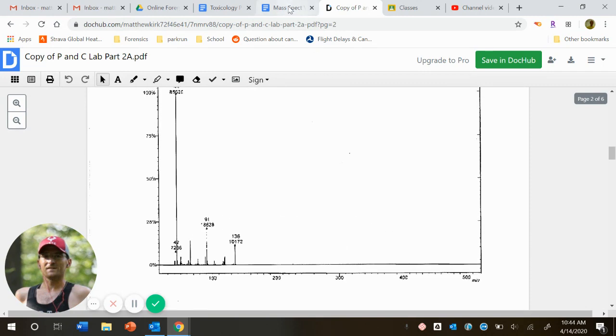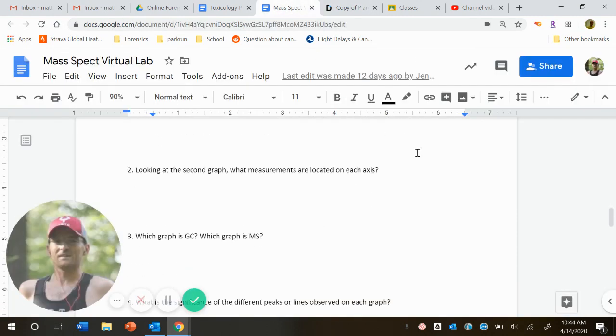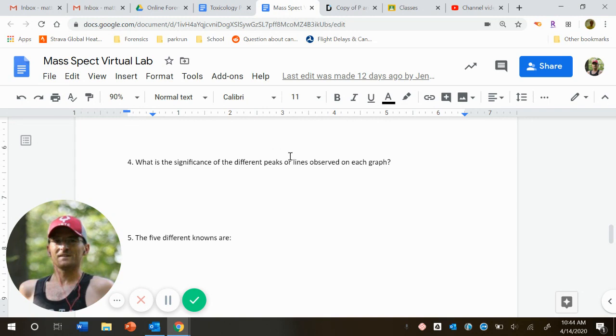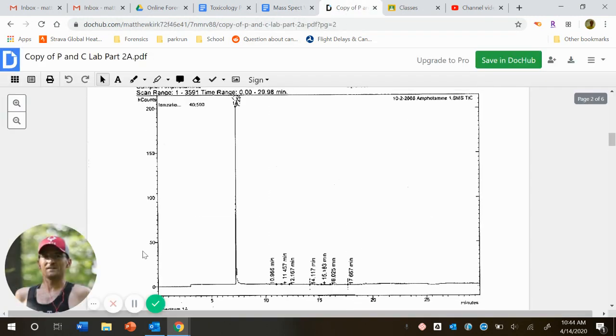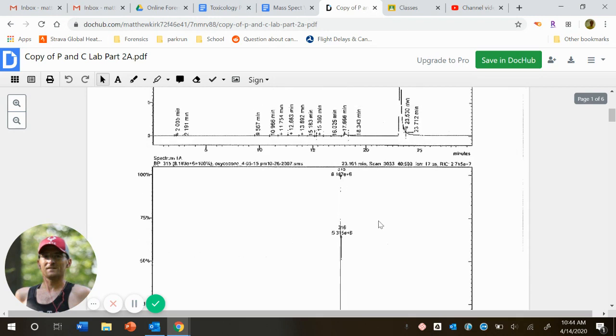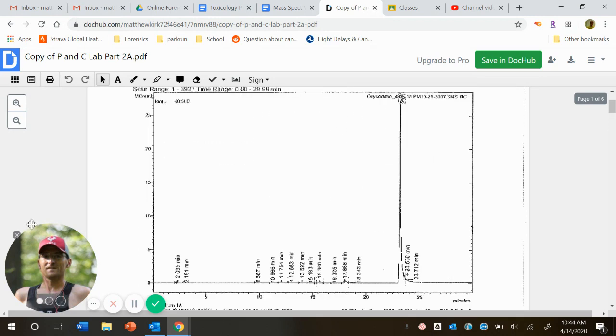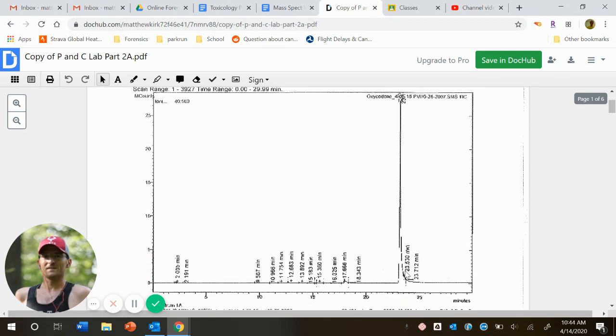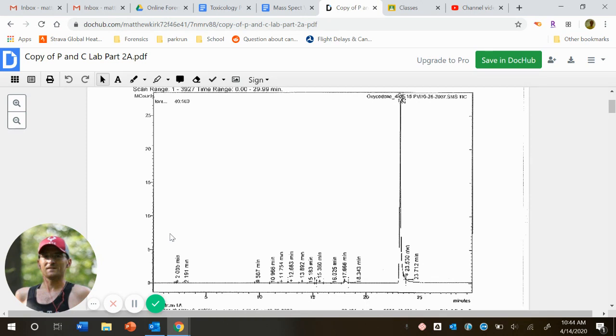Okay, back to our questions. Again, kind of the same thing that on our gas chromatogram, the peaks represent how long it takes for the compound to get through. So going back to oxycodone, again, big peak would be oxycodone. The little peaks are probably our impurities or things that have been added to the drug.